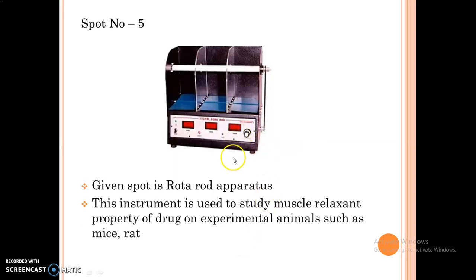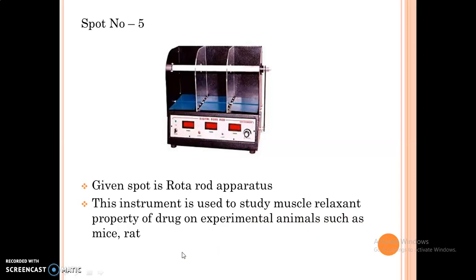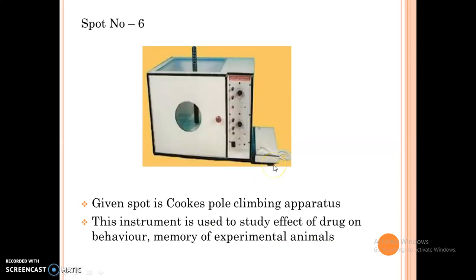The next spot is Rotorod apparatus. This instrument is used to study the muscle relaxant property of the drug on experimental animals such as mice, rat, etc. The next spot is Cook's Pole Climbing apparatus. This instrument is used to study the effect of the drug on behaviour and memory of experimental animals.